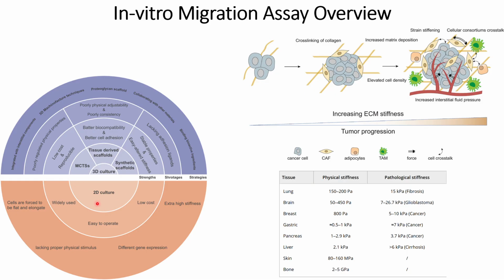The disadvantage is that cells are forced to be flat and elongated, which is not the case in vivo, or actually in patients.